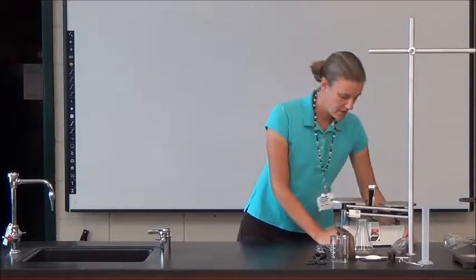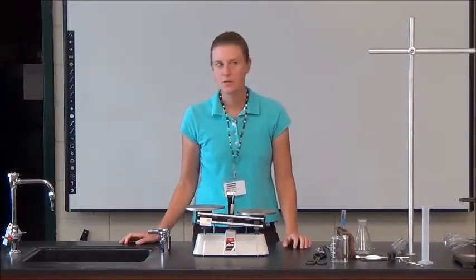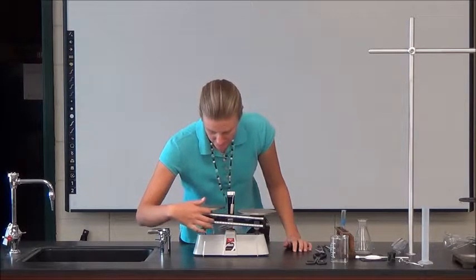I'm going to start with a balance. What does a balance measure? Mass. There's a slight difference with weight — it's actually not measuring weight, it's measuring mass. We'll talk about that a little bit.